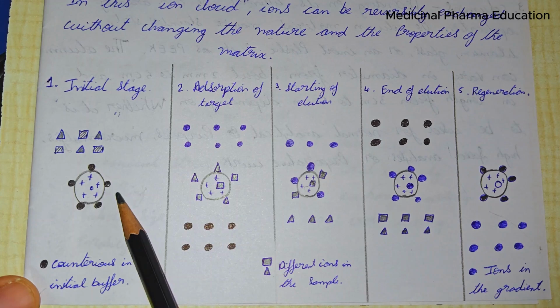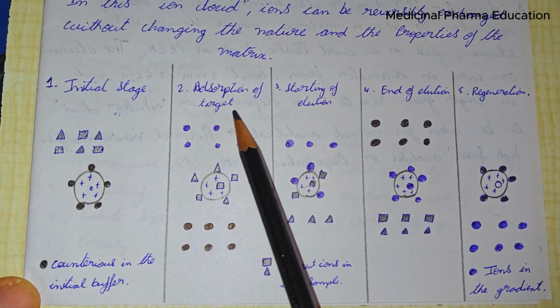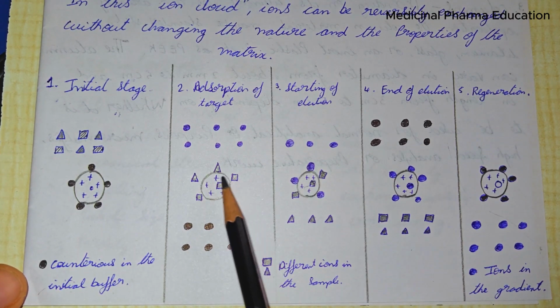Next, the adsorption of the target. It's not absorption, it's adsorption, because it is happening on the surface.